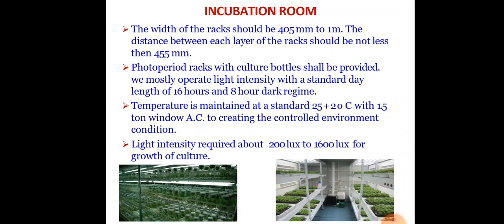Then the incubation chamber or incubation room or the culture room, both are the same. We are going to culture a wide range of plants in that room itself, so we have to maintain an aseptic condition. We have to provide photoperiodic as well as air conditioned provisions also. The light intensity should be 200 lux to 1600 lux for the plant growth for the photosynthetic purposes.